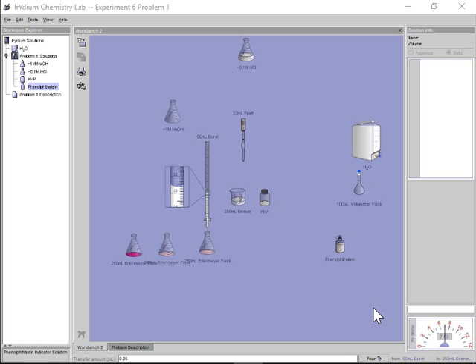At this point here, we have started off with our primary standard, which is KHP. This was a solid. I had calculated how much mass I would need. We standardized it in a volumetric flask. The volumetric flask is more quantitative. It's a really nice marking, versus beakers, which don't have one.